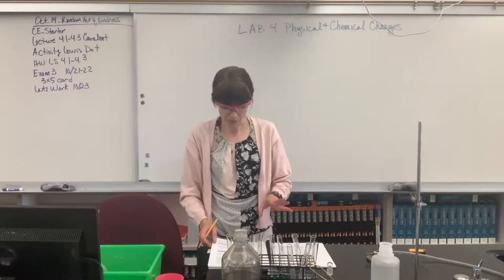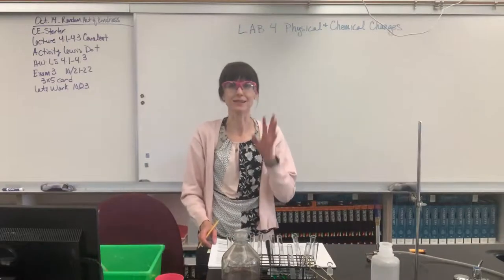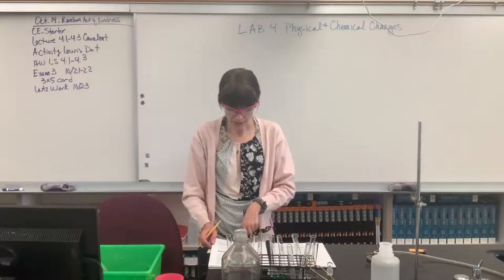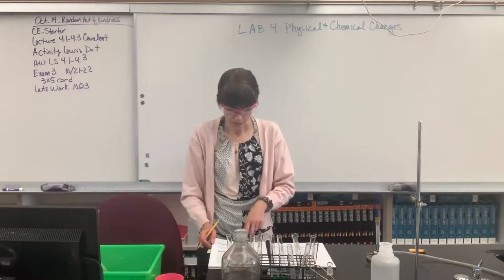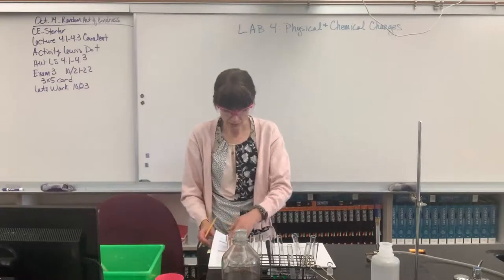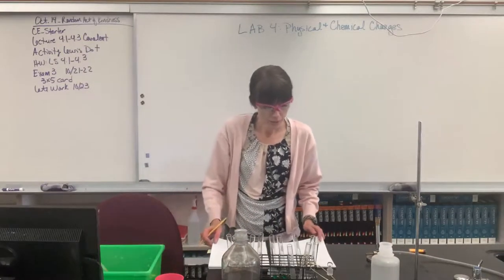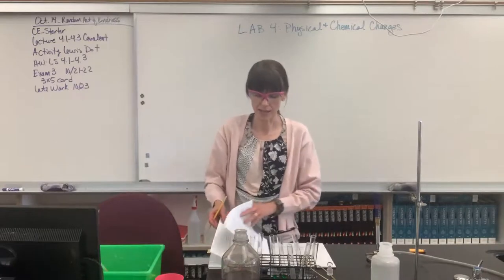Next step, it says, grasp one end of the other strip with your crucible tongs and hold the strip in the flame of your burner until the magnesium ignites. Oh, you guys are going to love this, so watch closely. And then it says to collect the combustion product, being careful to exclude any unburned material, and record the appearance, okay? And then we're going to add the HCl to that.